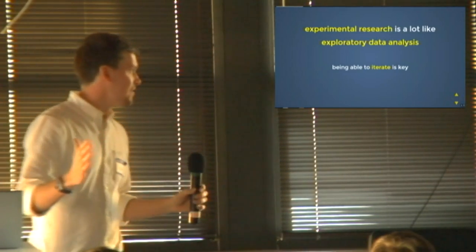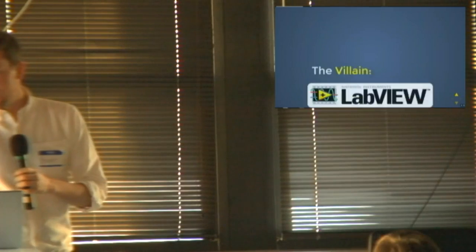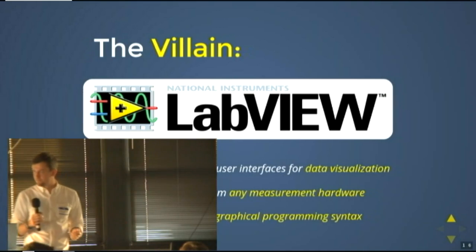Okay, so that's the exposition. That's the backstory. Now it's time to introduce the bad guy in this story. National Instruments LabVIEW. So for those of you who aren't familiar, LabVIEW is a graphical programming language aimed at people who need to interface with hardware. So people doing industrial or academic research or testing.